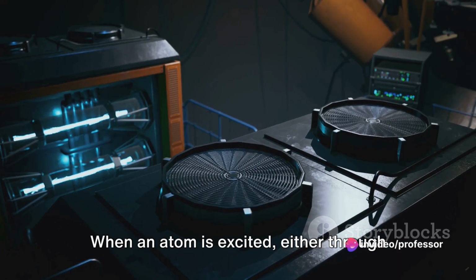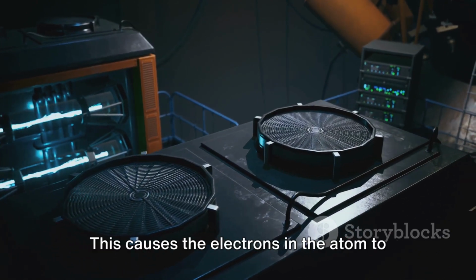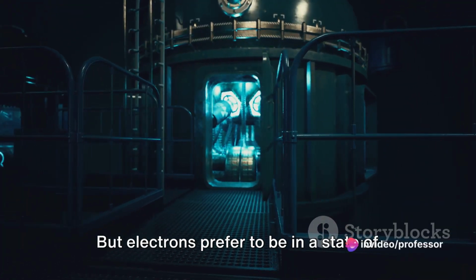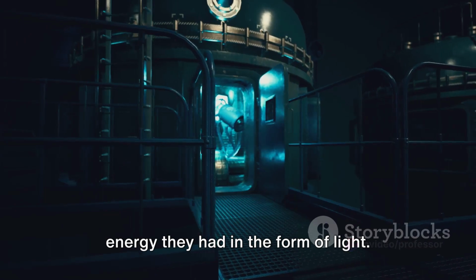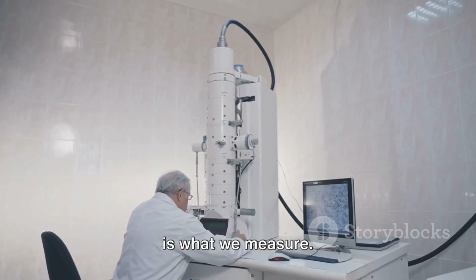When an atom is excited, either through heat or electricity, it's like it's been given a jolt of energy. This causes the electrons in the atom to jump from a lower energy level to a higher one. But electrons prefer to be in a state of lower energy, so they quickly fall back down. And when they do, they release that extra energy they had in the form of light. This light, or electromagnetic radiation, is what we measure.